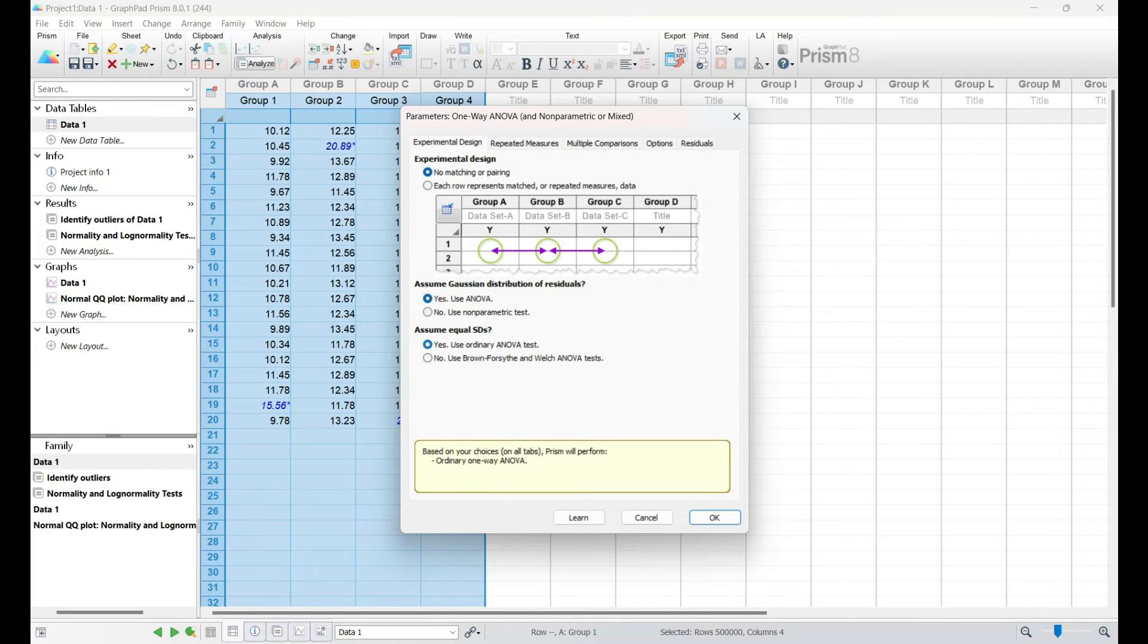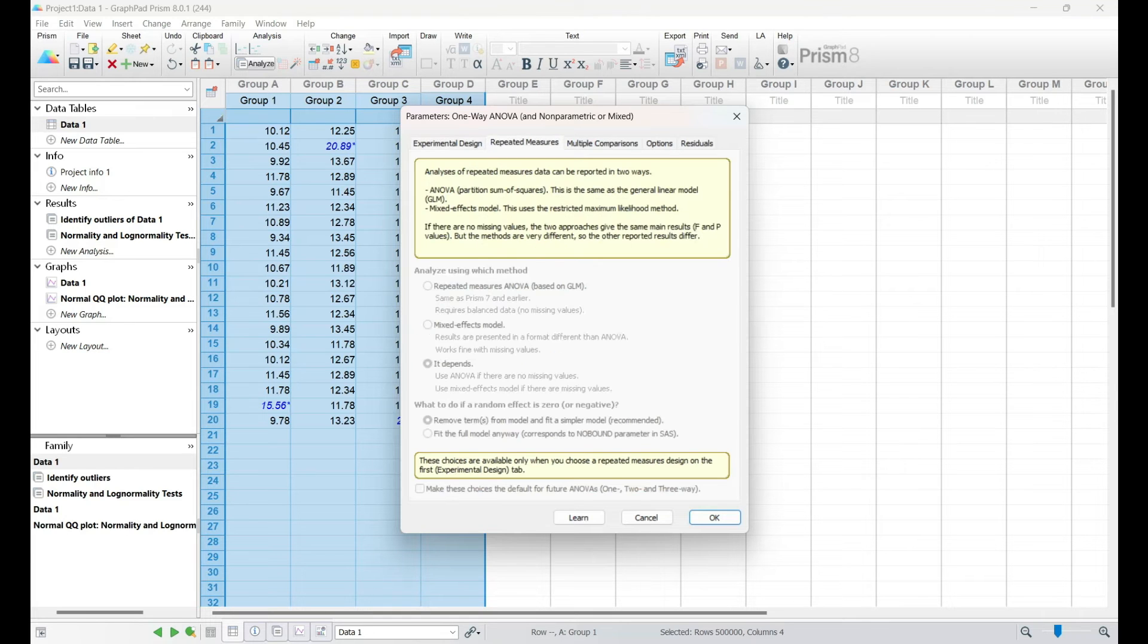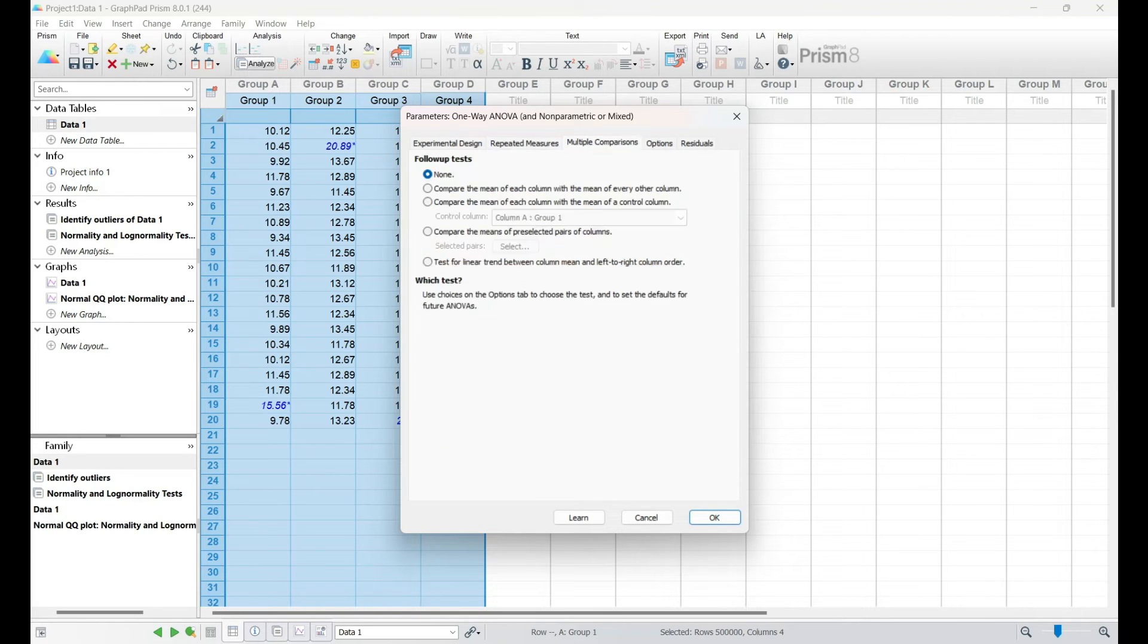GraphPad Prism simplifies the selection process, ensuring that even those new to statistical analysis can make informed choices.